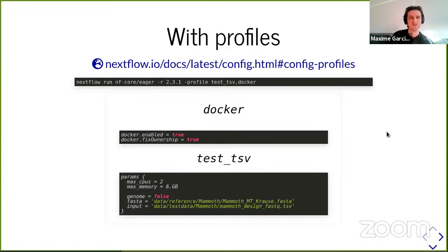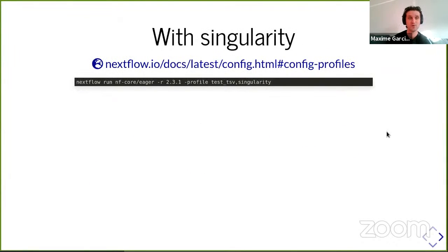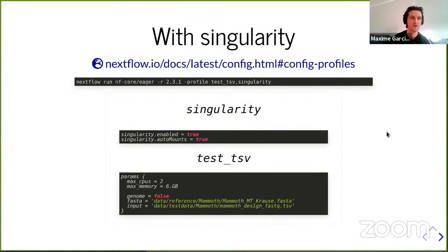The whole beauty with Nextflow and with profiles is that if I want to run the same command line but instead of Docker I want to use Singularity, I just need to specify the profile singularity instead of the profile docker. And within all nf-core pipelines, the profile singularity is already defined and explains how to use Singularity. So I just have to change the profile, and voilà, it's working. This is why I like Nextflow and nf-core — it's easy.